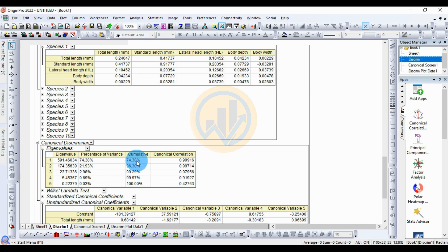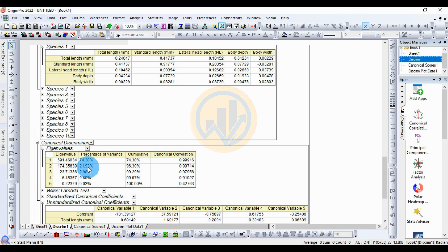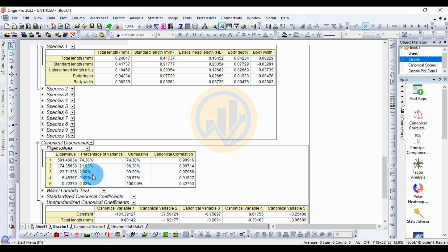The canonical correlation for variable 1 is 0.99916. For canonical variable 2, the eigenvalue is 174.35639, percentage of variation is 21.93%, cumulative is 96.30%, and canonical correlation is 0.99714. For canonical variable 3, eigenvalue is 23.71, percentage of variation is 2.98%, cumulative is 99.29%, and canonical correlation is 0.97956.